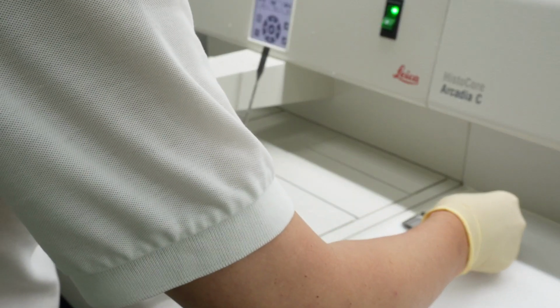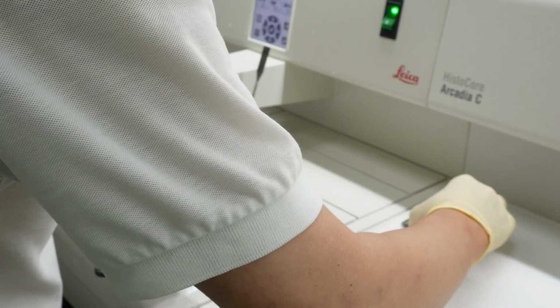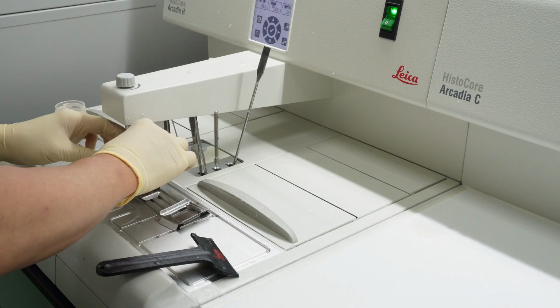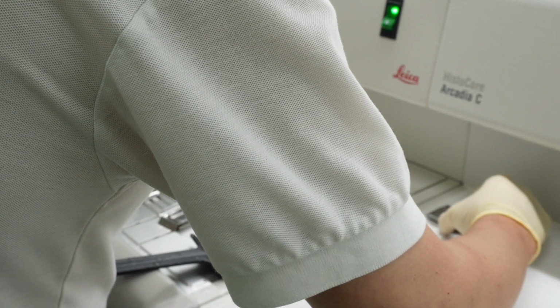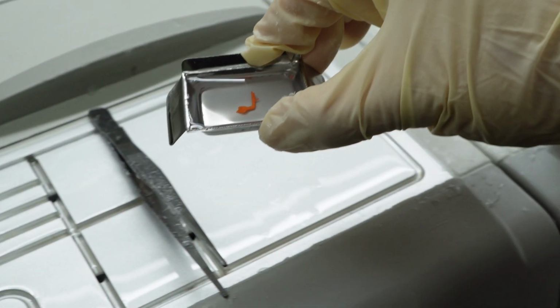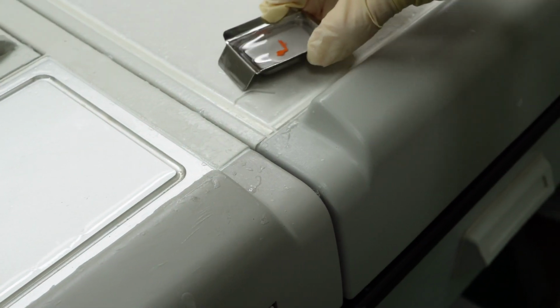What structures do you want to see later? Which way do you need to slice through the embryo to see them properly? You orient it carefully in liquid wax. So if you want cross sections versus longitudinal sections, you position it differently here. Precisely. Get the orientation right. Let the paraffin cool just enough to hold it in place.